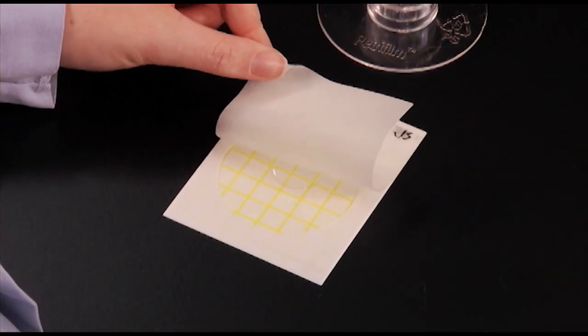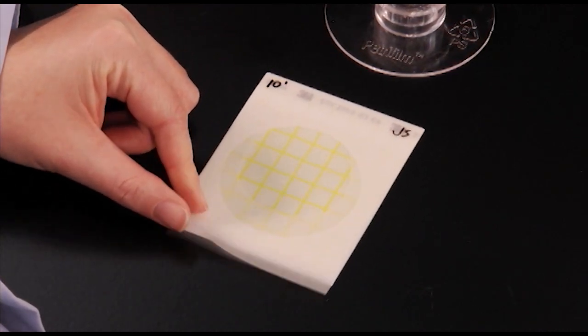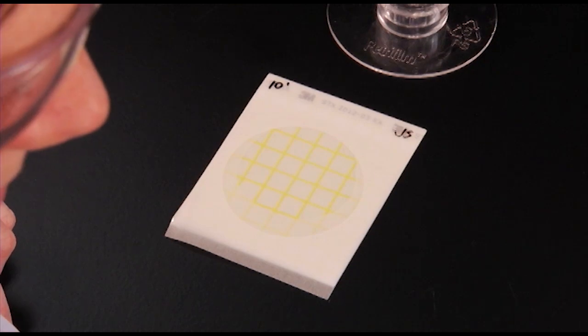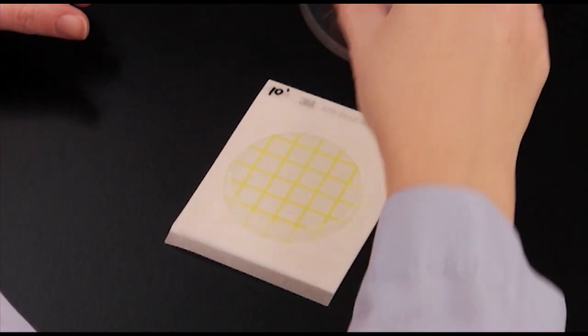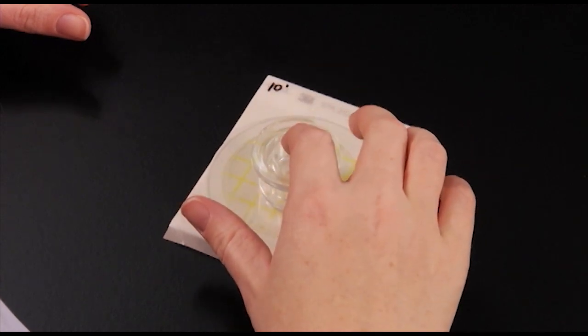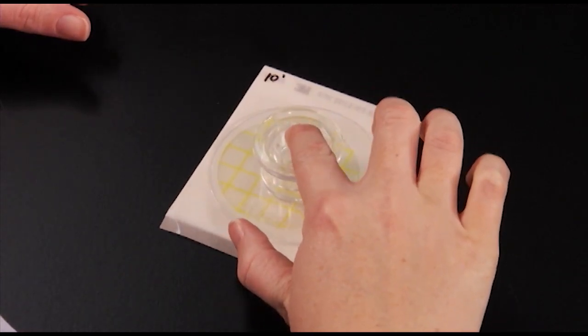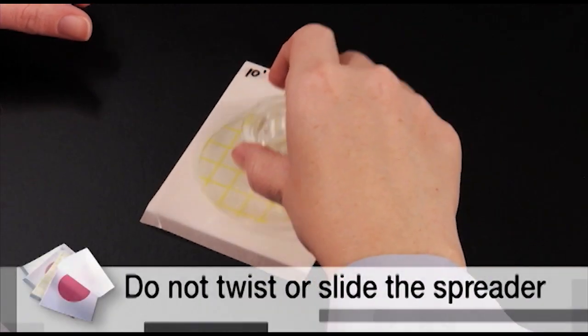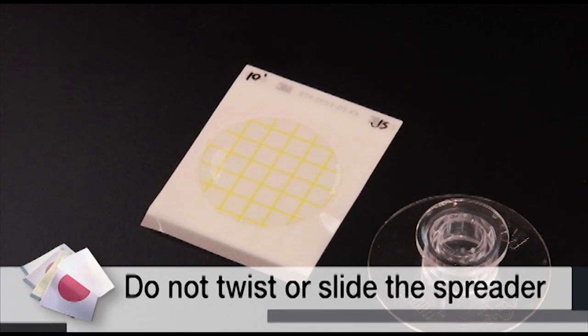Carefully roll the top film down to avoid entrapping air bubbles. Pick up the appropriate spreader with the flat side down and place it on top of the film, over the inoculum. Then, gently apply pressure on the center of the spreader to distribute the inoculum over the entire circular area. Do not twist or slide the spreader. Lift the spreader and allow 1 minute for the gel to form.